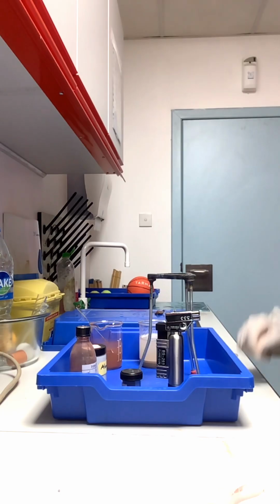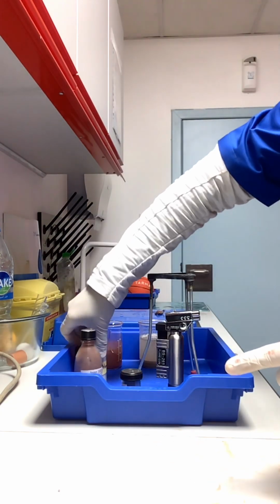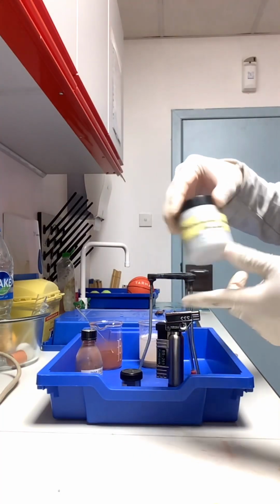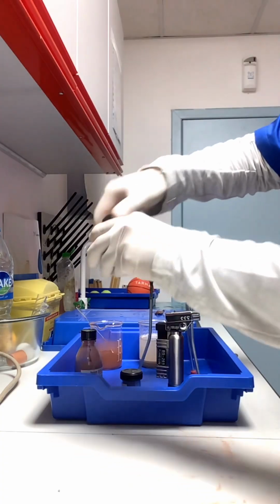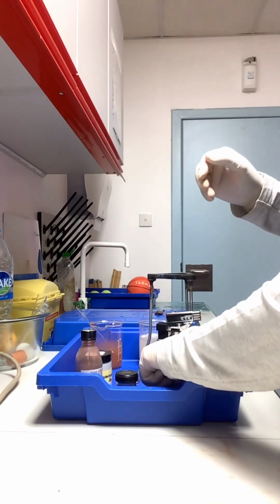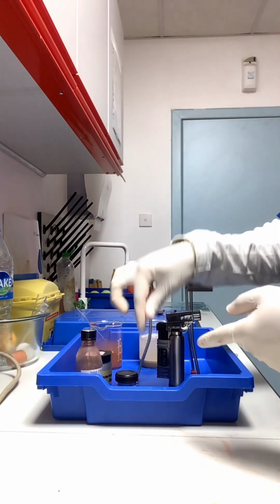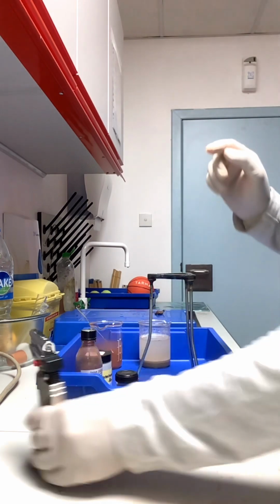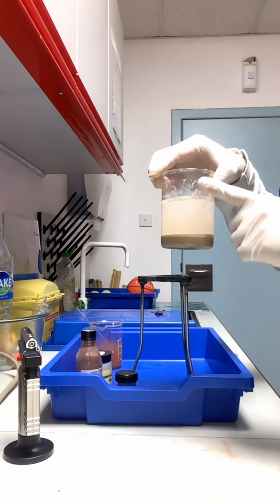For the thermite experiment you would require iron(III) oxide powder. You would need aluminium powder, the aluminium metal powder, which is the one that is grey in color. You need some magnesium powder, a strip of magnesium ribbon, a blowtorch, a tripod stand, a beaker with water and some sand.